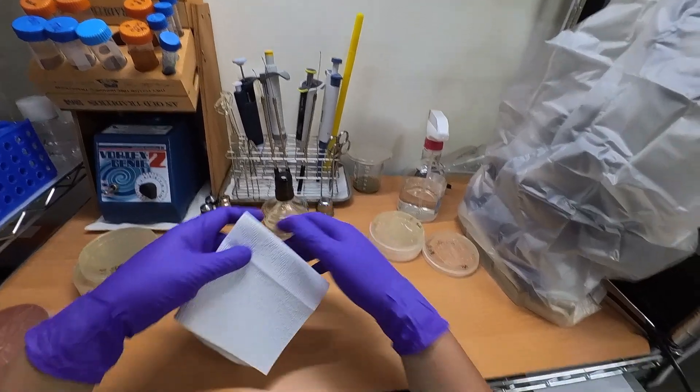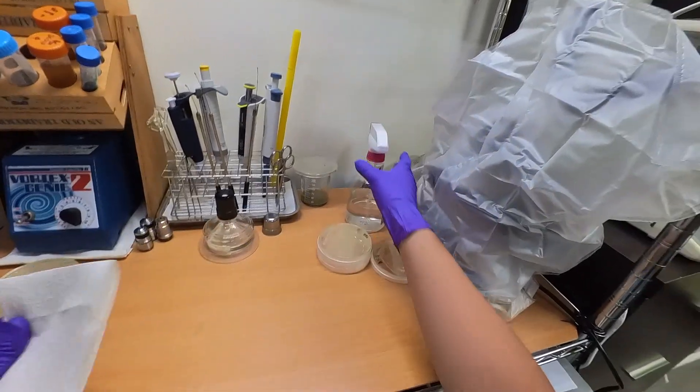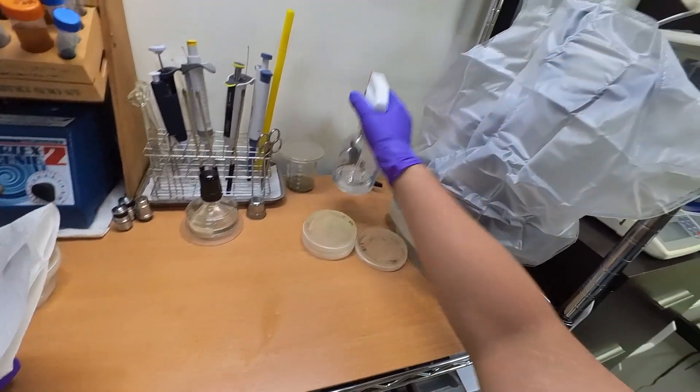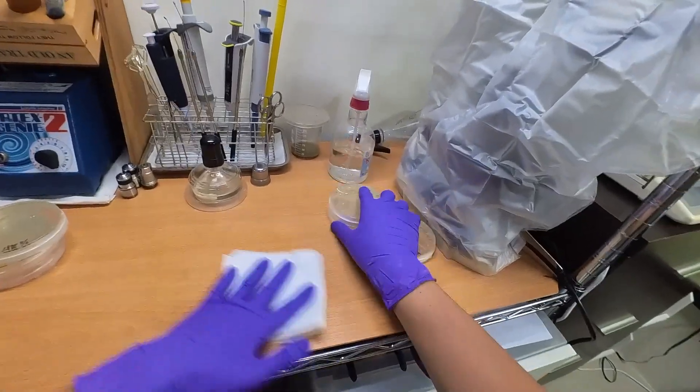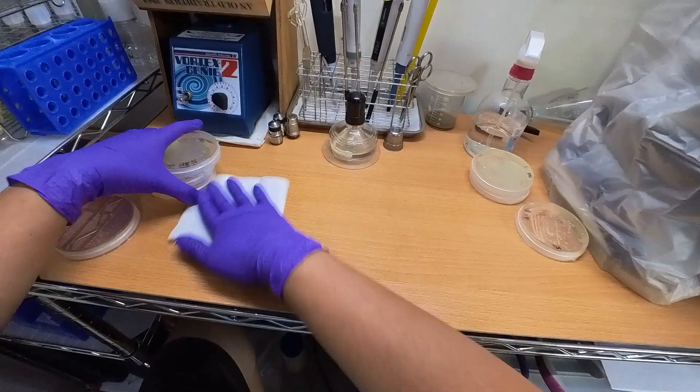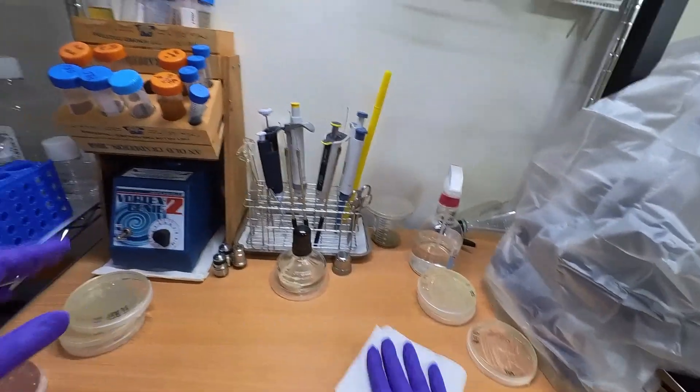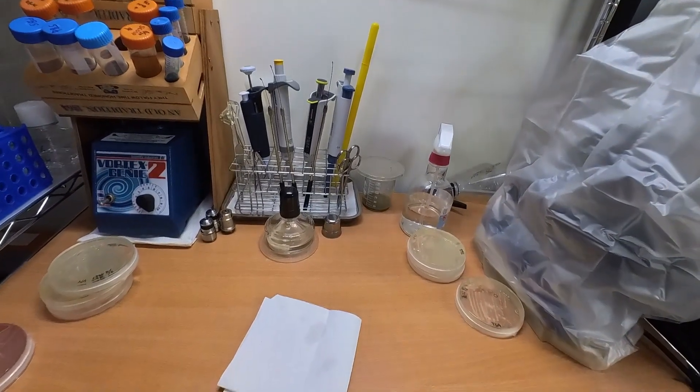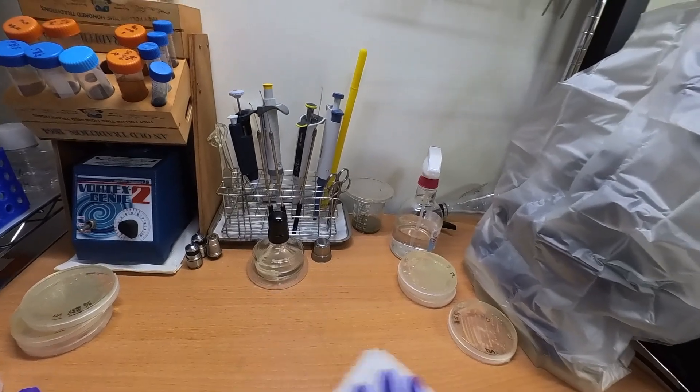Why is that? The reason for this to happen is lack of information. You might think that I have all 8 test results, so how can it be a lack of information? Well, the truth is, when it comes to biochemical tests, there is just too much that you can ever do.